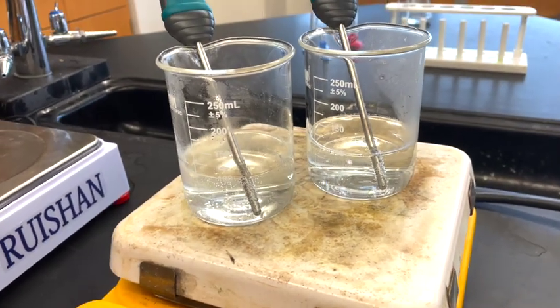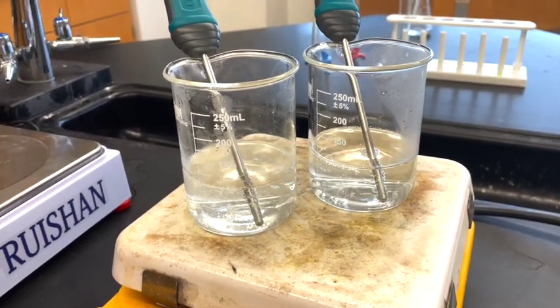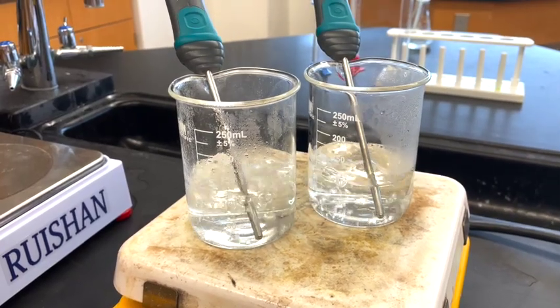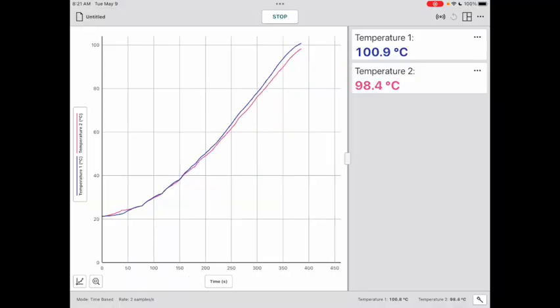you can see that these both are starting to bubble rather vigorously, which means we have reached the boiling point of both of the solutions. If you take a look at the temperatures of the boiling liquids, the blue one is about 2 degrees warmer than the red one, as you'd expect because it is a solution where the other is just water.